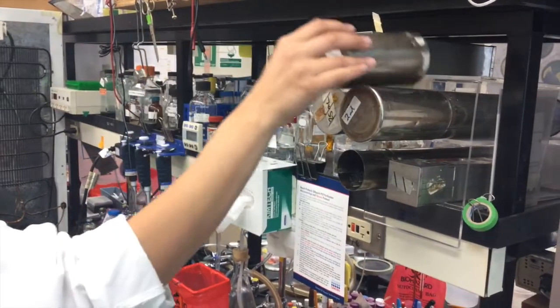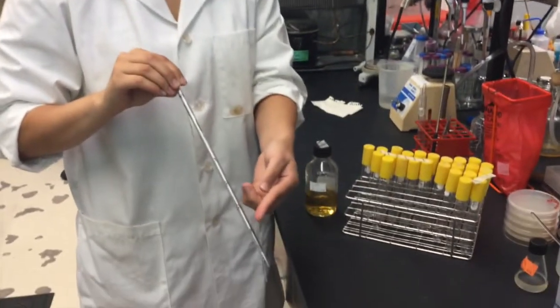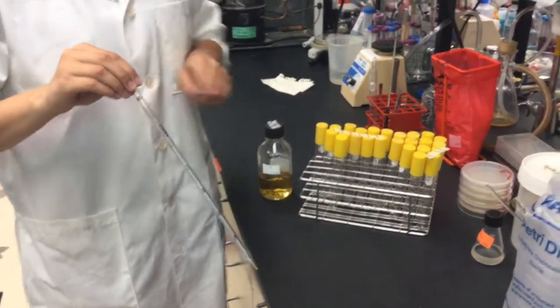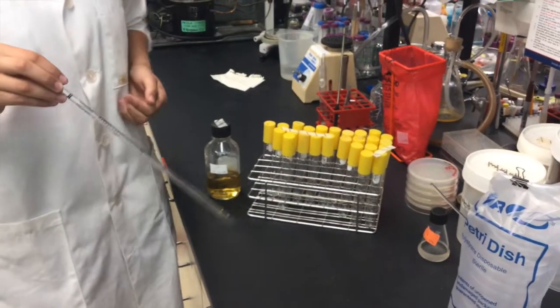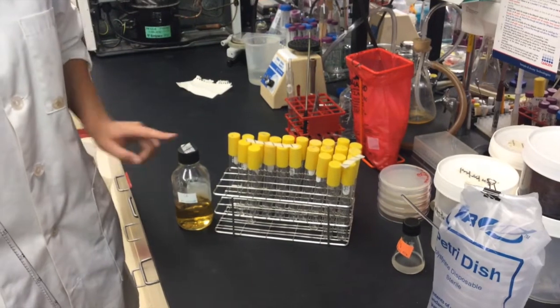We will use a sterile pipette to transfer the broth. A pipette is an instrument that transfers a specific amount of liquid from one container to another. Today, we will be transferring LB from the jar into the glass tubes.